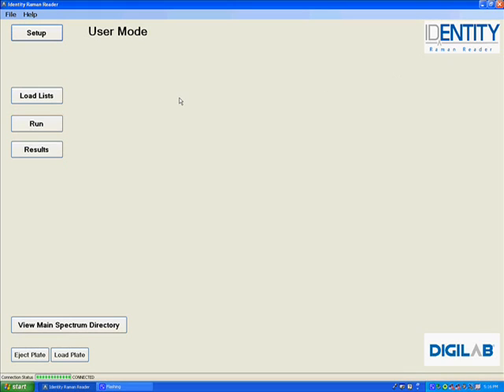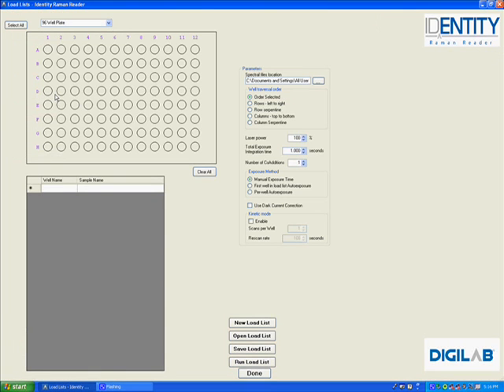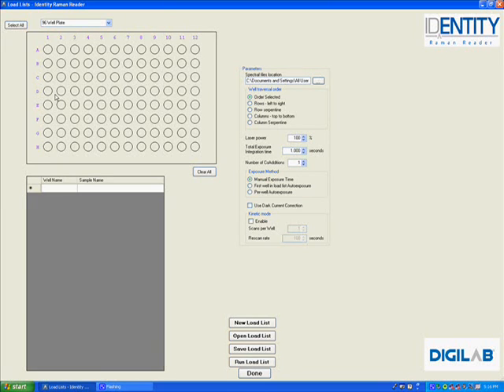The user first goes in and sets up a load list, which allows the user to take a plate map view and define the well or wells that they would like to scan.